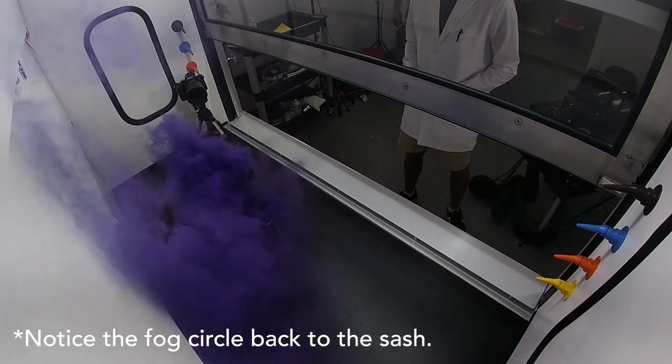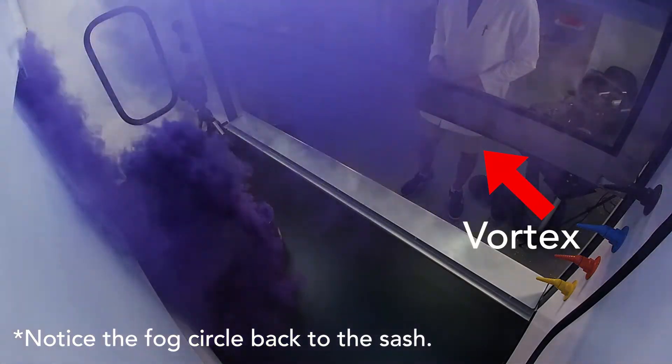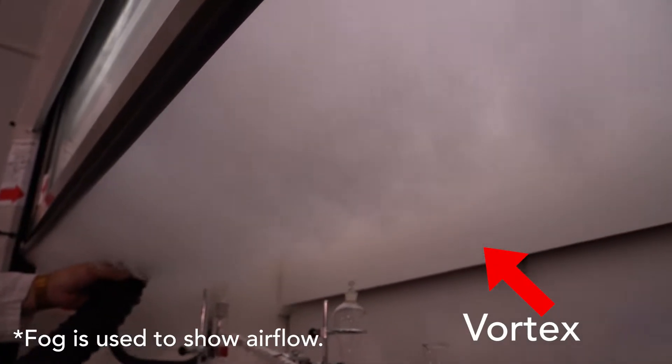While the sash provides protection, it is also a potential source of hazard. There can be contaminated air present at the edge of the sash, and there can be a vortex of contamination just behind the sash. These vortices have the highest concentration of contaminants. You want to keep the edge of the sash as far away from your breathing zone as possible. Generally, the breathing zone is the area from your chest to the top of your head.